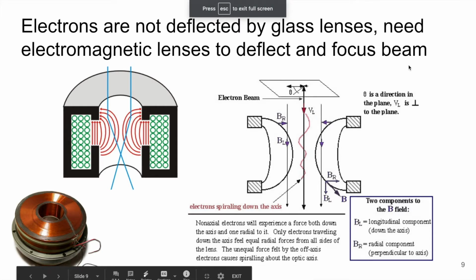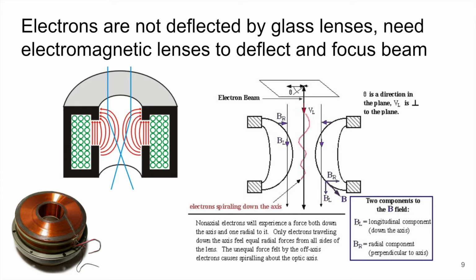All right, so let's now talk about the lenses used in electron microscopes, particularly SEM, since that's what we're talking about now. So we have an electron beam, and as I said in the lead up to this, that means that we can't use simple glass lenses like is used in light microscopes because glass lenses won't focus electrons like it does light.